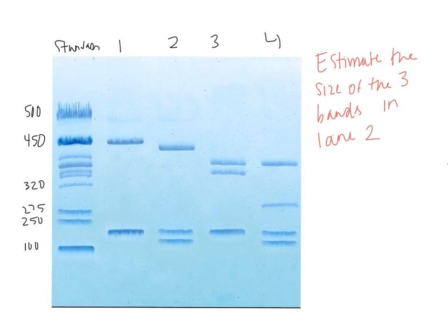Okay, that's your basis for electrophoresis. The key thing is you have to know how restriction enzymes work to find out how many cuts are made and how many fragments are made. Then you have to be able to analyze a gel. Can you tell me the size of a fragment? Can you tell me who it belongs to based on the same banding pattern that you're looking for? Okay, those are the key things to take away from gel electrophoresis.